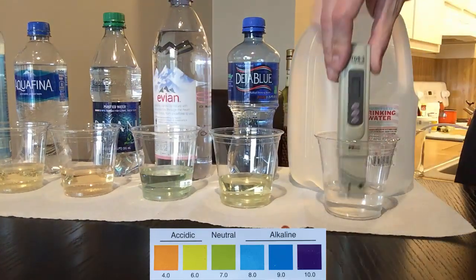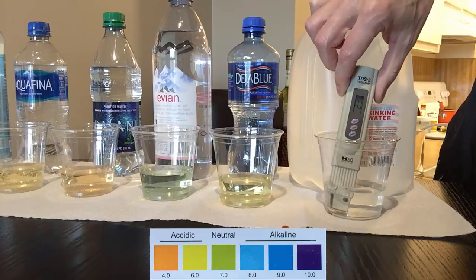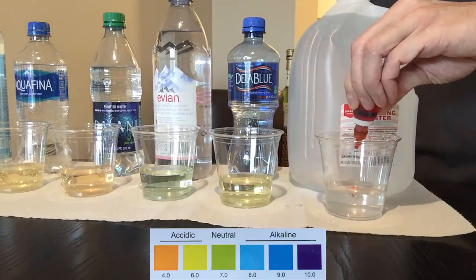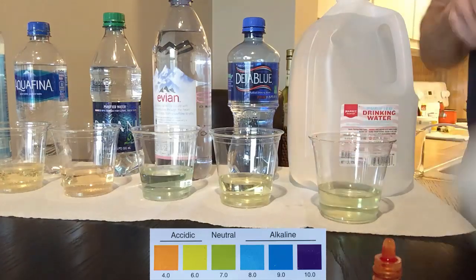This water is bottled by Target. They use municipal tap water filtered through reverse osmosis, and then added small amounts of minerals back for taste. At a TDS of 23, this water looks pretty clean, but a little bit acidic at just about 6.5.